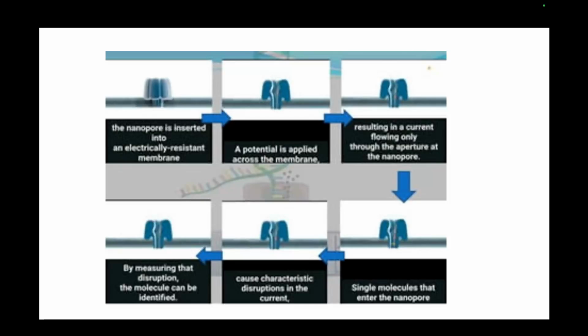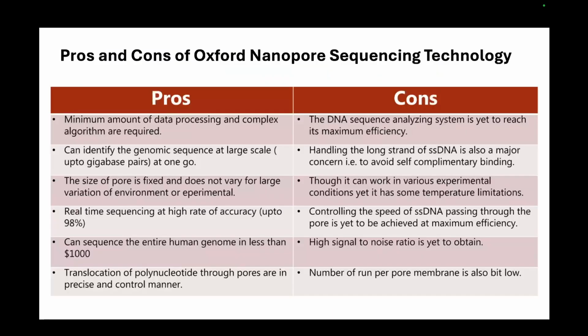This is quite widely used, and I should say that it is quite expensive compared to Illumina or Ion Torrent sequencing. Although it is expensive, it is very accurate. If you want to study long variations in the genome, these technologies give very big reads, which can go up to a lot longer than what Illumina can give you. So if you want to detect big variations inside your genome, this type of technology is the one that you should use.